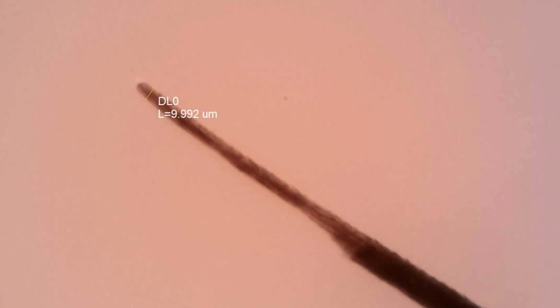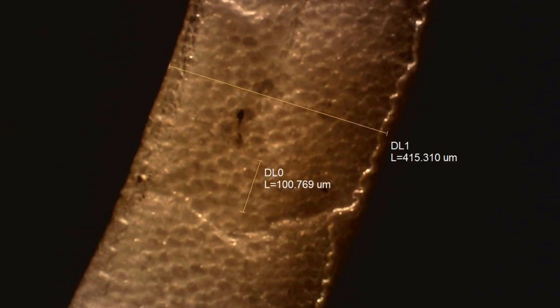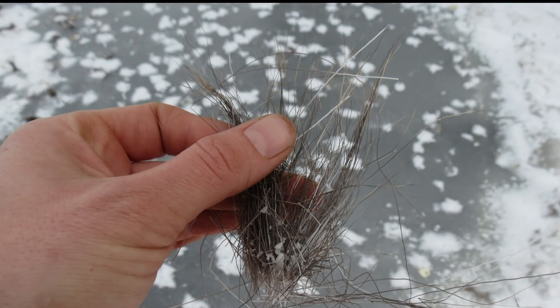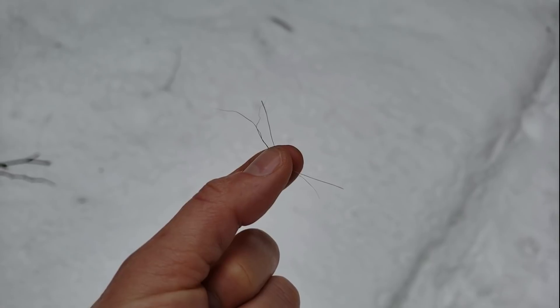Another interesting fact about deer hair is that it has a very pointy root bulb and the cortex is rarely visible. Moose hair, however, tends to be a lot wider — about 200 to 400 micrometers wide — with smaller scales per hundred micrometer distance, usually three to four scales. The cuticle is similar between the two with an imbricate texture. Elk hair is similar in size to deer hair but has three to ten scales per hundred micrometers.